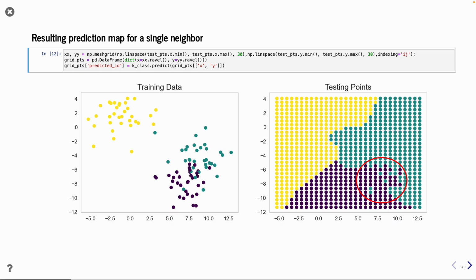line. However, if you look at the intersection between the other two classes, you see here, not with today's light, so maybe I should shade a bit.